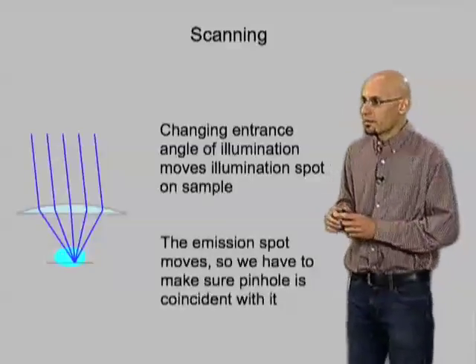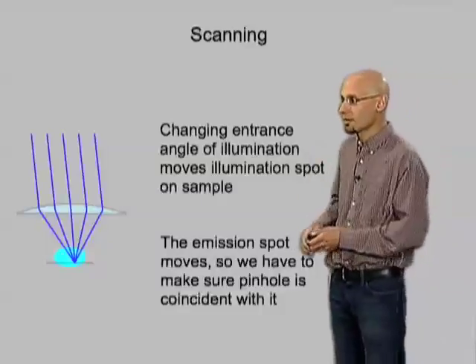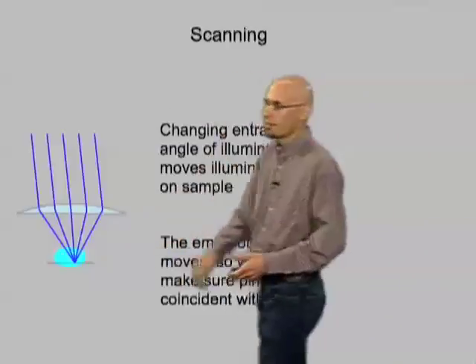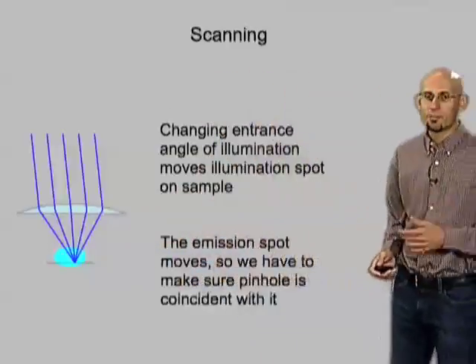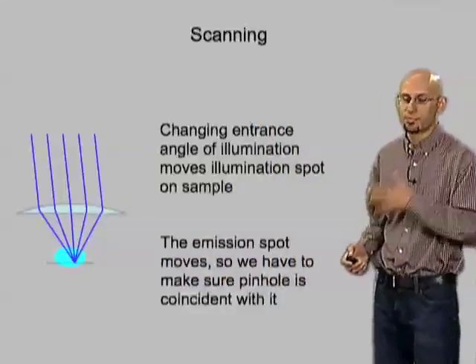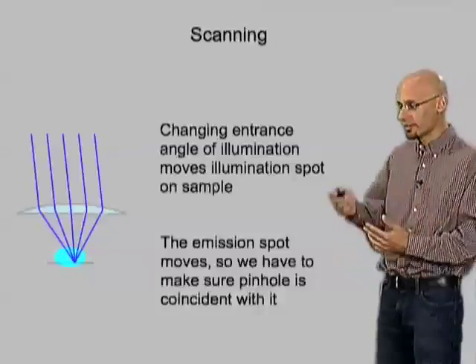Of course, in the diagram I showed you before, the pinhole was fixed, and so this light coming from the side of the sample over here wouldn't make it through the pinhole. So we need to have some way of getting the light so that no matter where it comes from in the sample, it goes back through that same pinhole so that we can throw away the out-of-focus light.